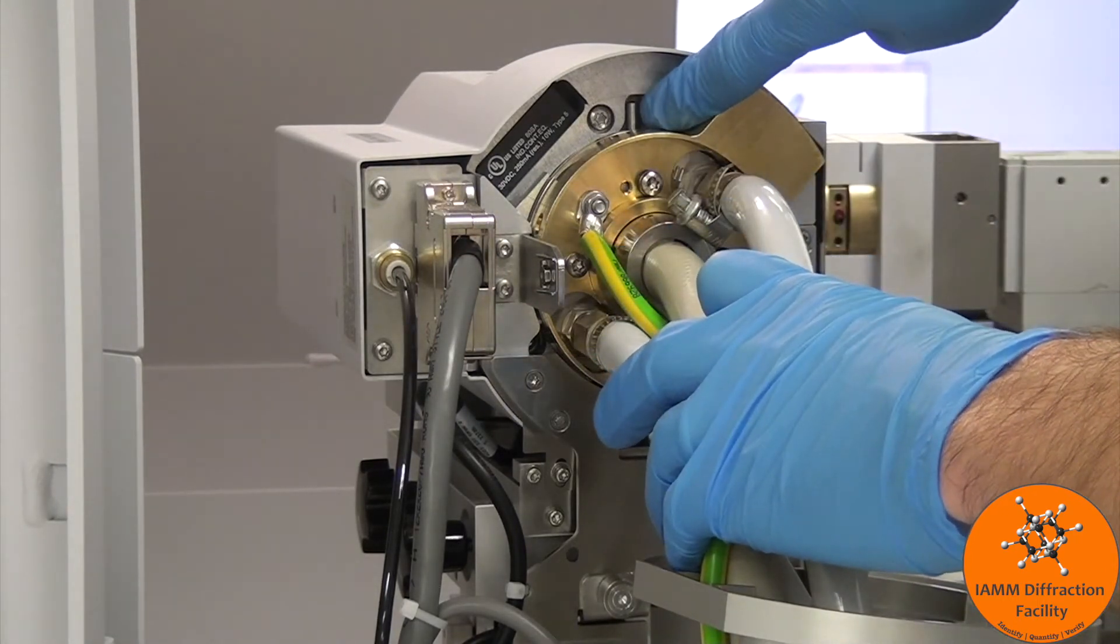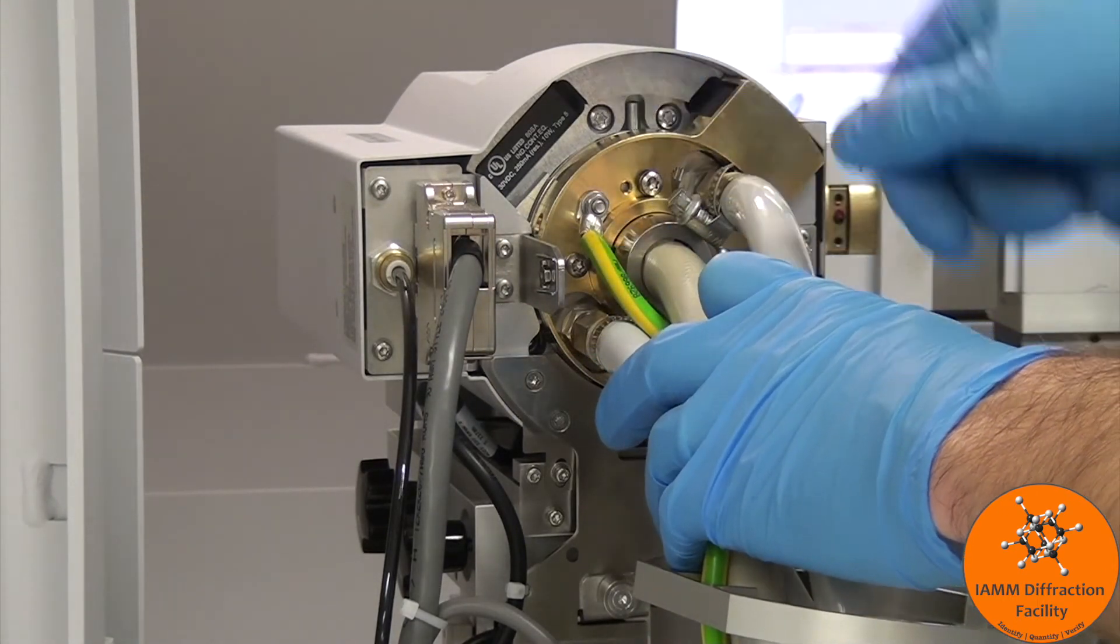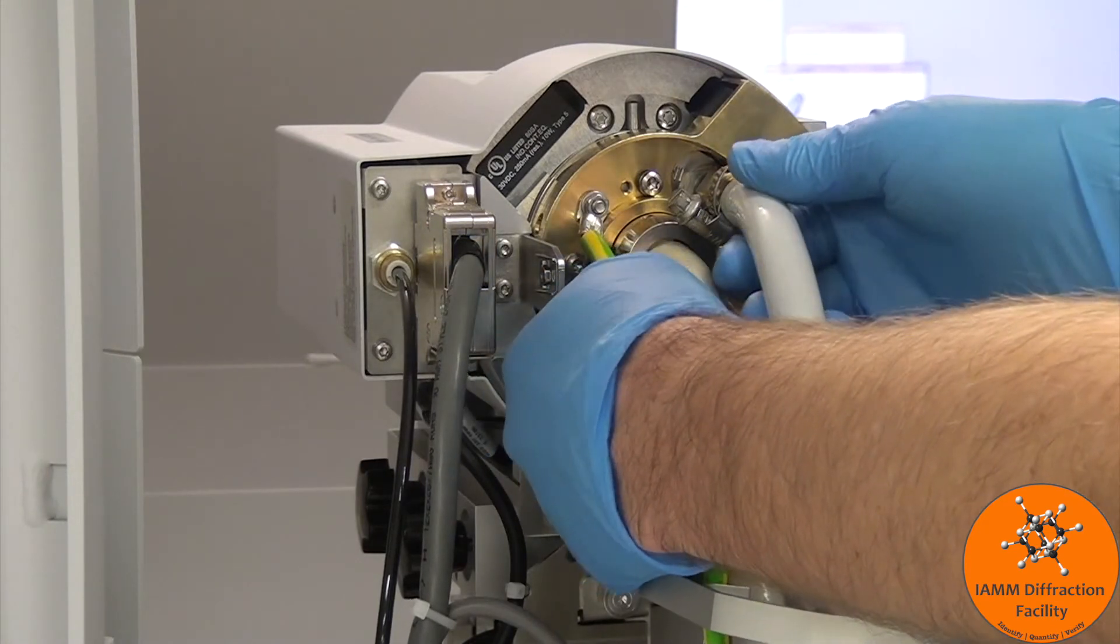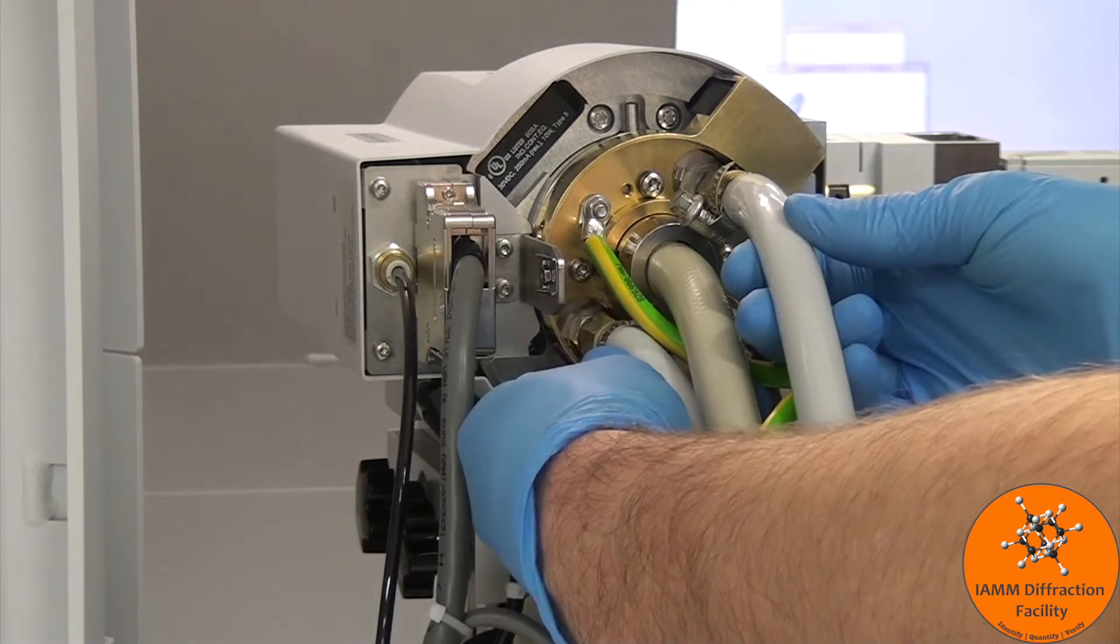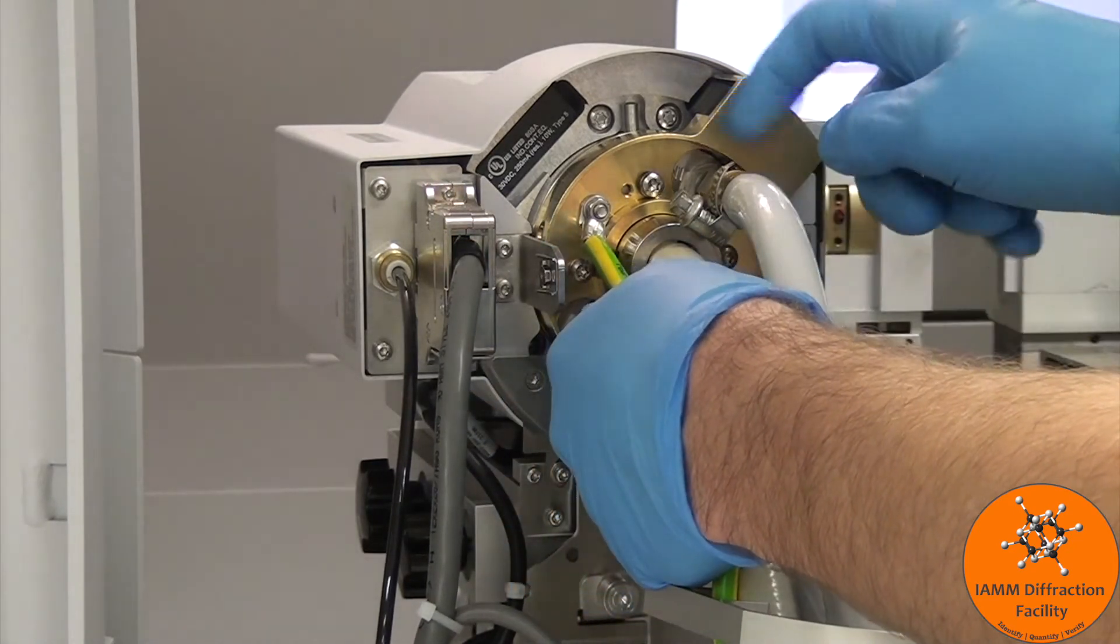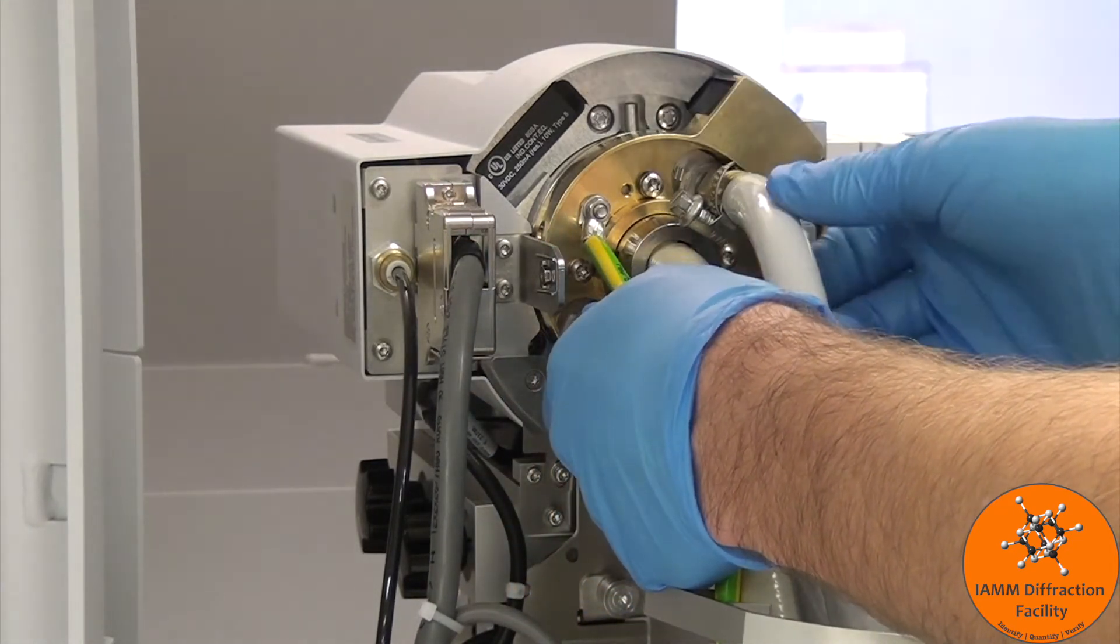You see that there is this little rod here that goes into a seating position. All we are going to do is pull the entire tube back somewhat. We can pull it from the water lines. We now see that the little rod has come out.